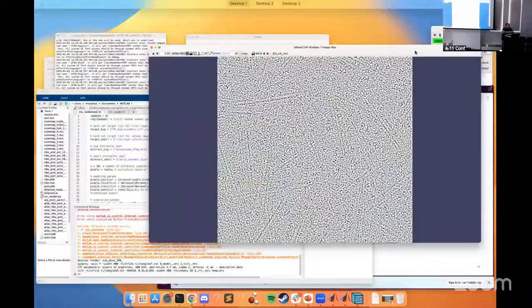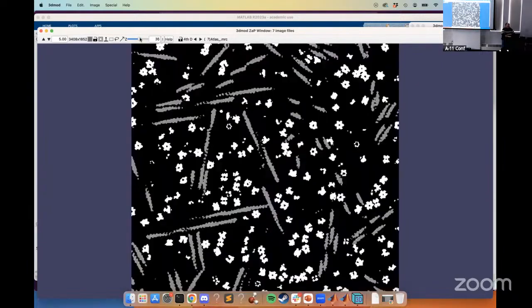Let me auto this for you. It doesn't look great. It always looks kind of like real data. Very low contrast, but then you'll have this tomogram that gets spit out. And you can control all the defocus and whatnot. But you also get this map.